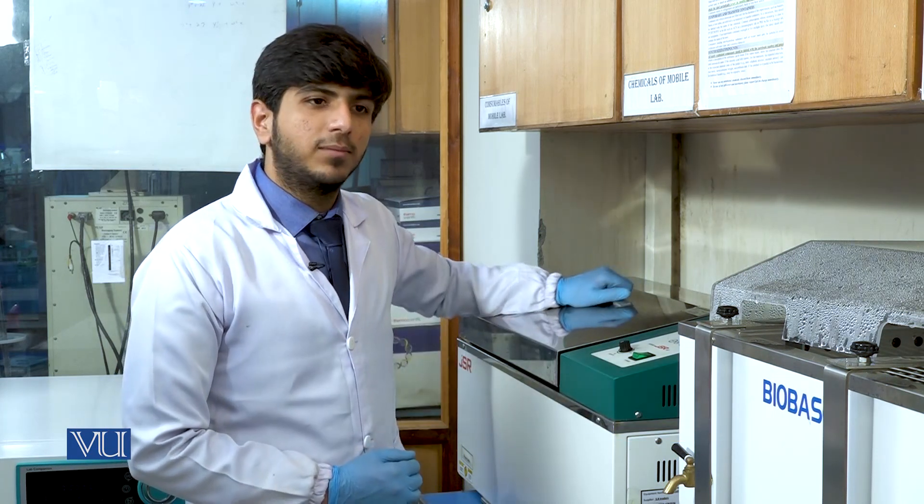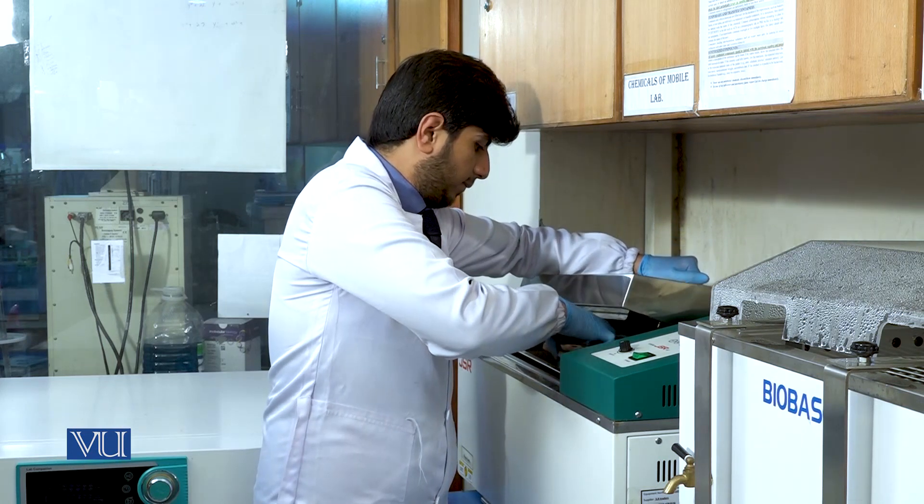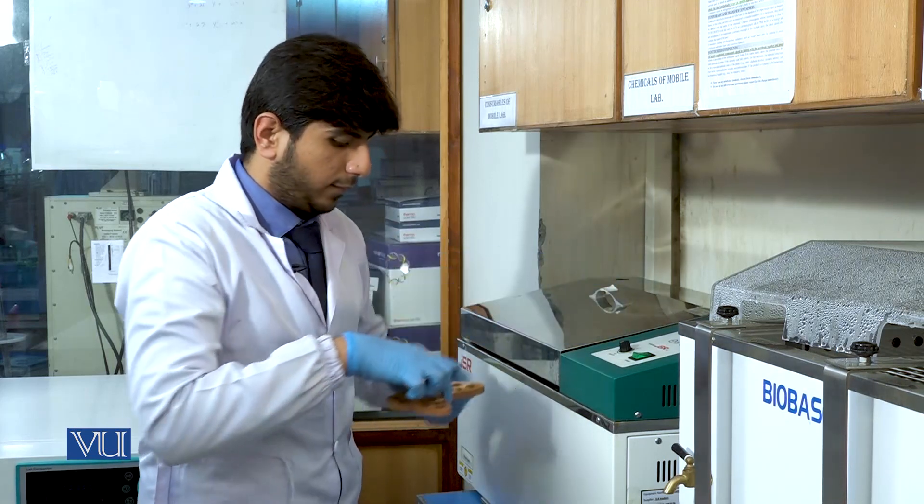In Part B, first of all, we will pick the samples from water baths and then add the phenol chloroform isoamyl alcohol. This is our sample after the overnight digestion. After the overnight digestion, we will complete the process of DNA extraction, which is Part B.